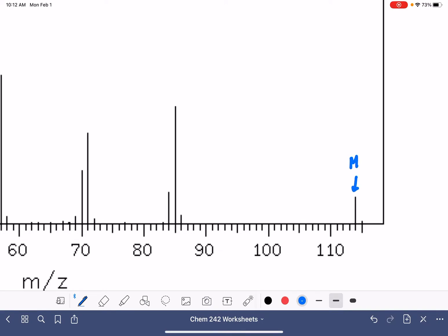This is our M plus peak, and this corresponds to the molecular weight, which is 114. So because this is 114, it's not an odd number, so we assume that we have no nitrogen present in this molecule.